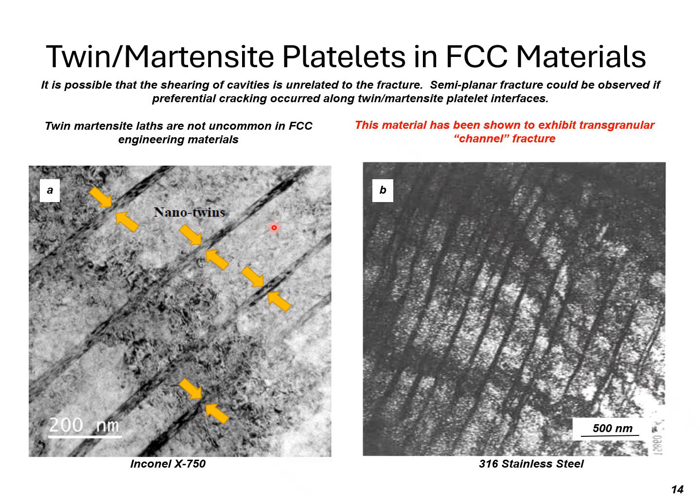Queens, Puyang Chengisian did some nice work to recreate the deformation of Inconel X750 spacers, and he was able to show that you get the same kind of planar features which were identified as nano twins, but they could also be martensite. In this case, the planar features were identified as epsilon martensite.